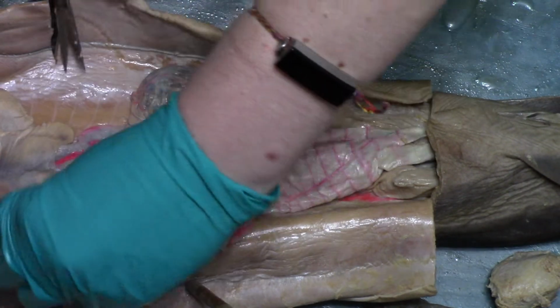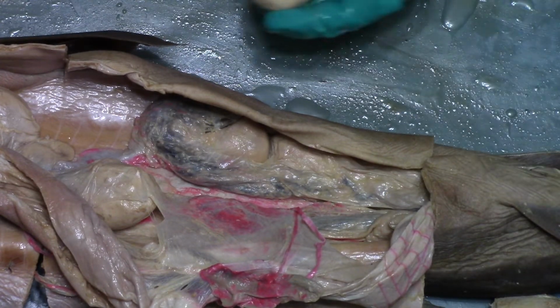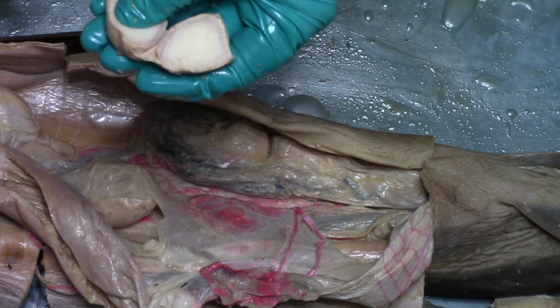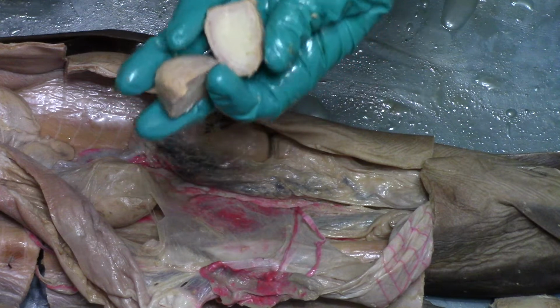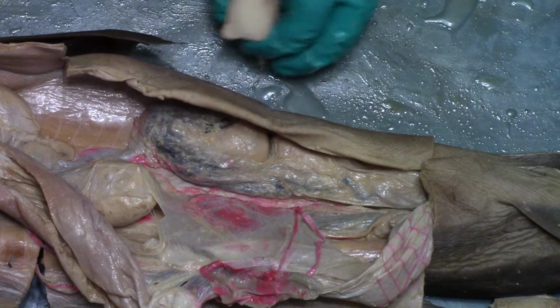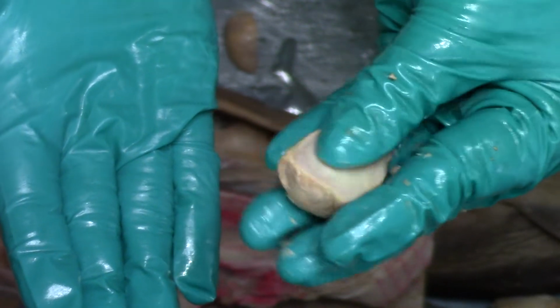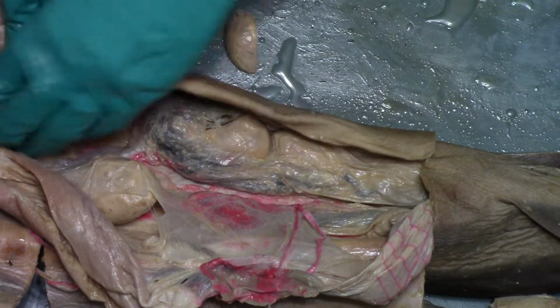So I think we can work around this if I move this to one side. Let's cut open one of these. Oh, neat. Like there's no tissue in it yet. It's like solid, plasticized, like a hard-boiled egg. That's kind of what it feels like too, like a hard-boiled egg. It's kind of neat. Just sort of solid. Whoop! Flying eggs. So there's a lot of them in here.